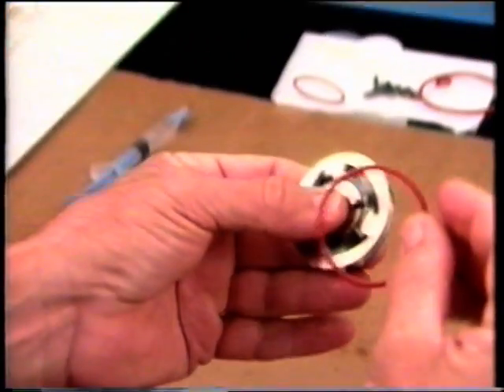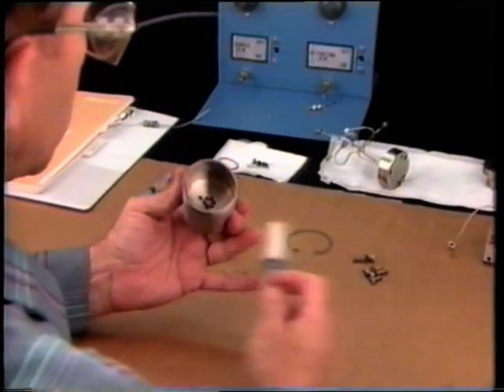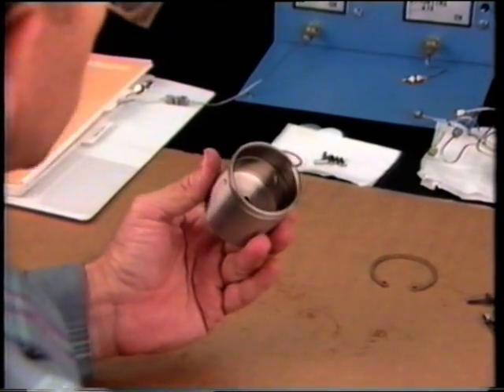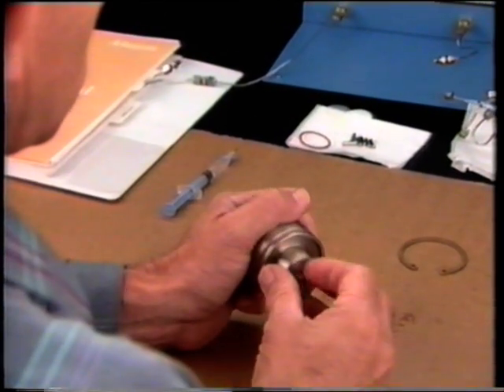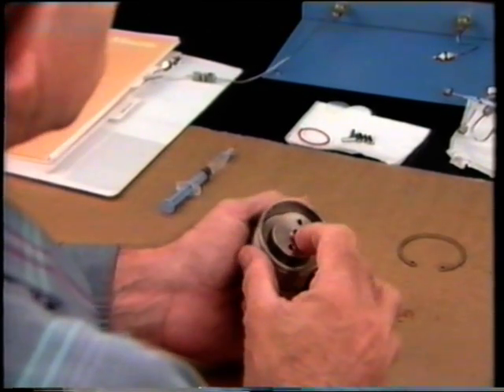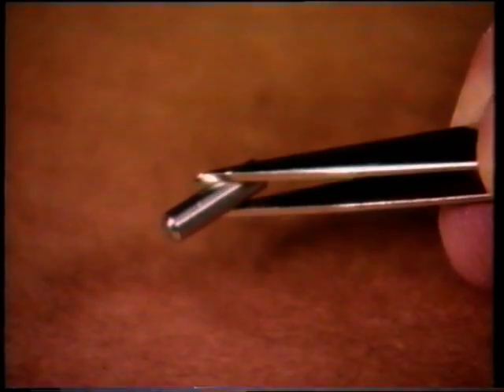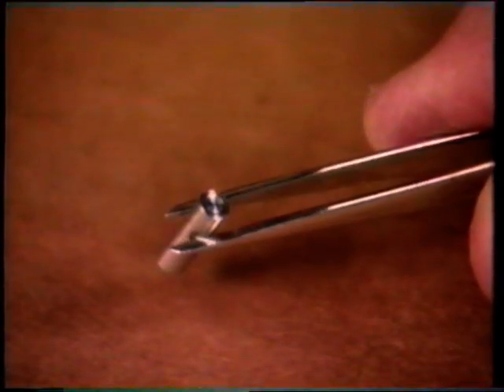Install new O-rings and apply grease to the valve parts as the valve is reassembled. Apply manufacturer-recommended lubricant to the inside of the valve body. Place the assembly containing the spring, compression plate, set screw, base, and compensation plate into the valve body. Reinstall the retaining ring. When replacing the plungers, be sure to position them with the beveled end down.